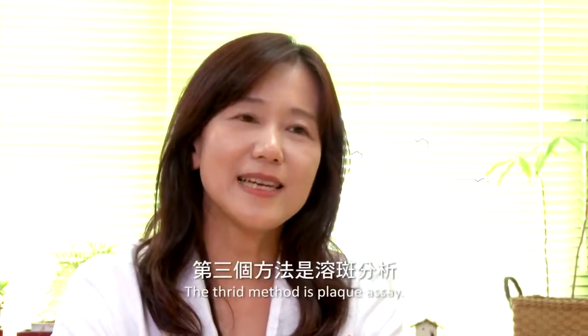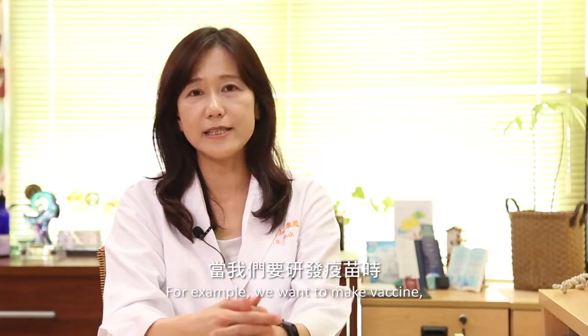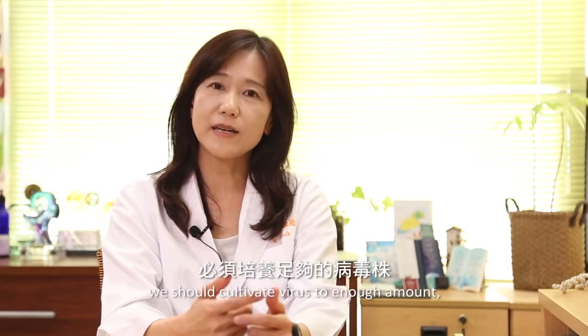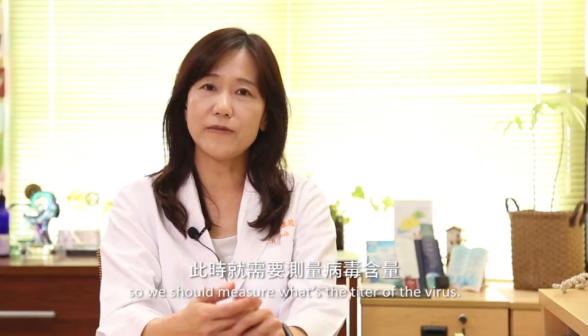The third method is plaque assay. Plaque assay is commonly used to determine viral titer. Why is determining viral titer so important? For example, we want to make a vaccine. We should cultivate the virus to an enough amount, so we should measure what the titer of the virus is.